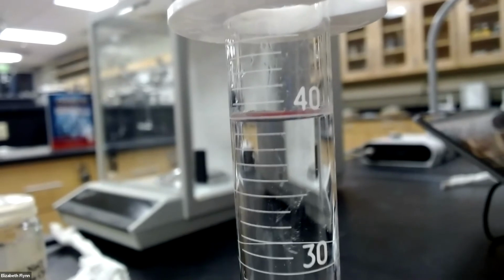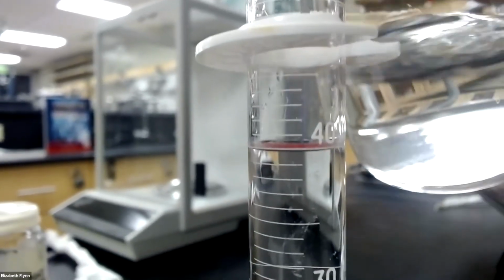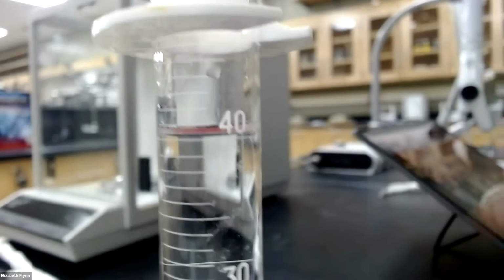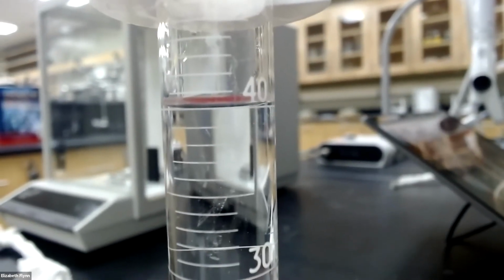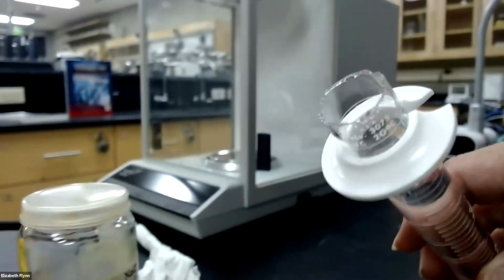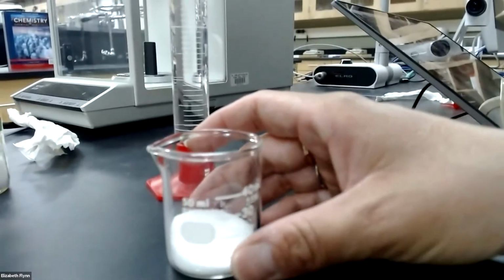Right, that is close enough. I could add a couple more drops of water to make sure the bottom of the meniscus is right on the line. And that's pretty darn close. Yep, eye level, right? Bottom of the meniscus is right on the 40. And I'll add it to my salt in my beaker.